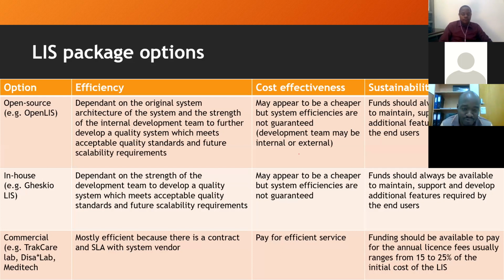So it's important that you have a strong development team in-house that understands the standards and also the regulatory framework, so that all those features are embedded within an LIS. And then in terms of cost effectiveness, both the open source and in-house may appear to be cheaper, but system efficiencies may not be guaranteed, because you are working with your internal development team that may not have full exposure of what is happening externally in terms of the trends and standards in the whole bigger picture of development.